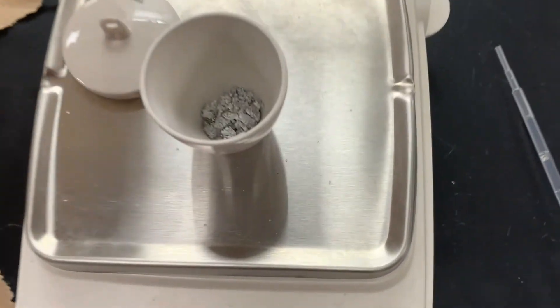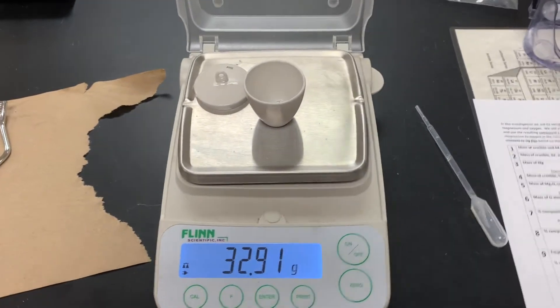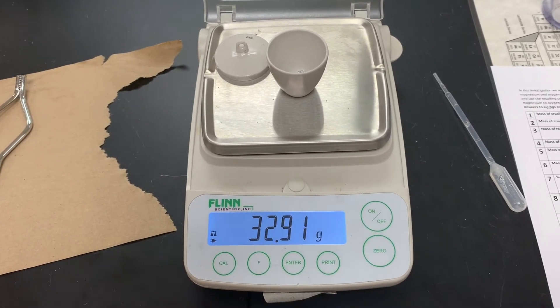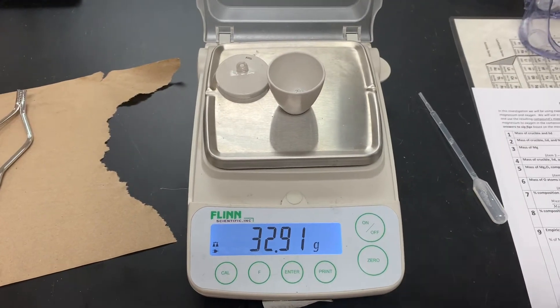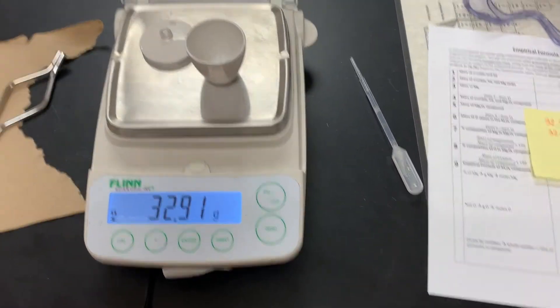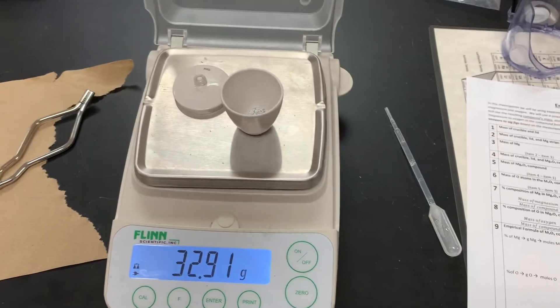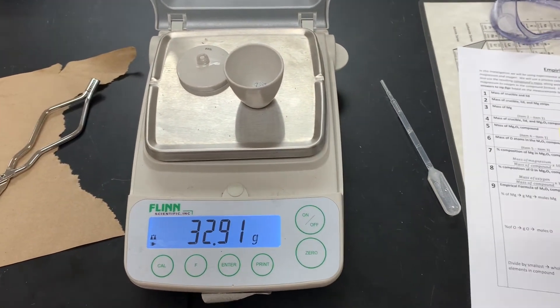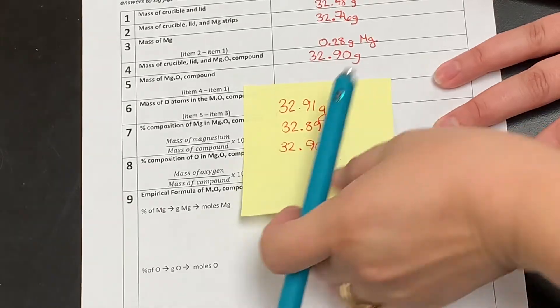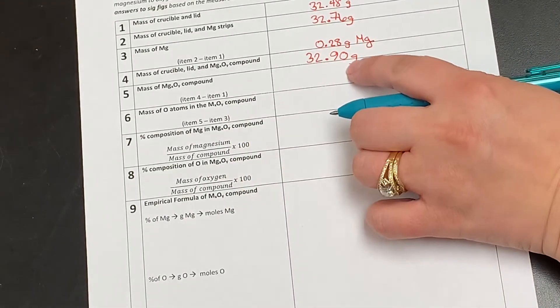I have cooled this down and I've got it on the balance. Now I am not going to record this as my final mass yet. We're going to heat it a few more times to make sure that this mass doesn't change. I've heated this again and my mass did come out a bit different this time — it was at 32.89, which may just be from air getting in. So I'm going to reheat it one more time, cool it, and see if the mass changes again. I did heat and cool one more time and the mass came out really close again, so we're going to use our final mass as 32.90 grams.